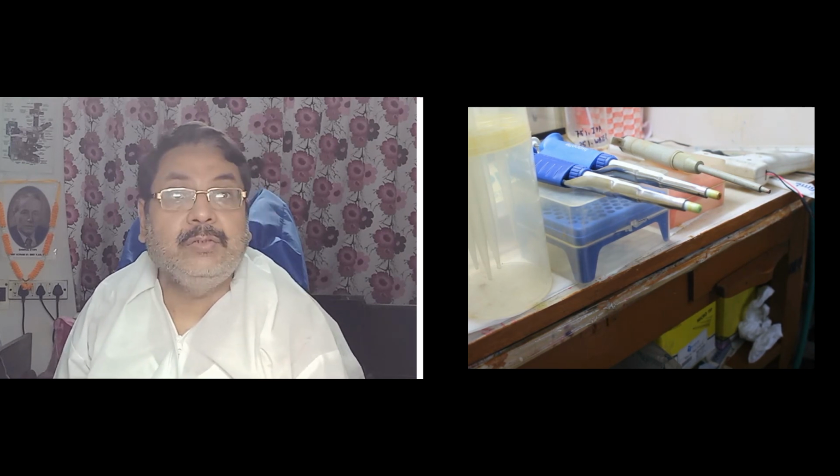There we will be using two instruments which I will demonstrate. One will be the autoclave and another one is the UV chamber. That we will be discussing in the next tutorial.